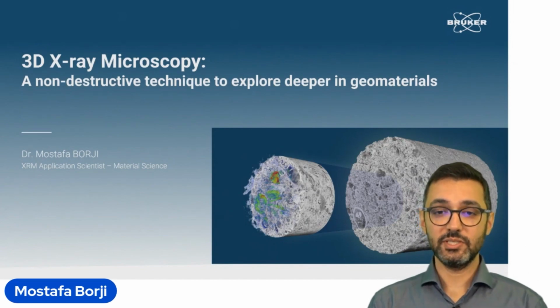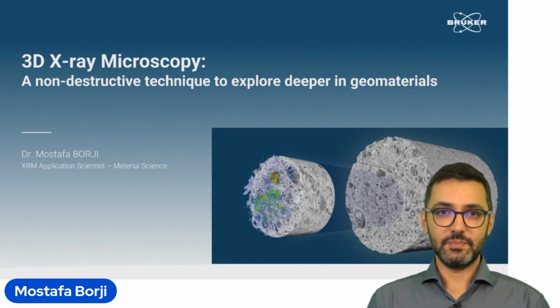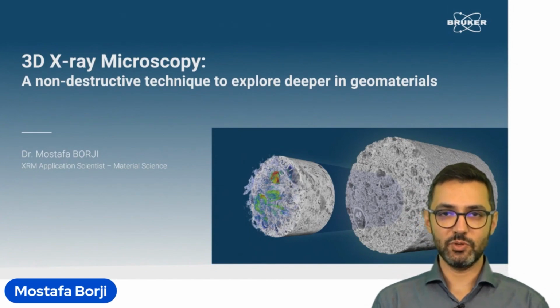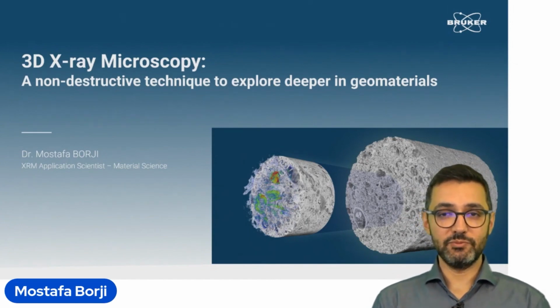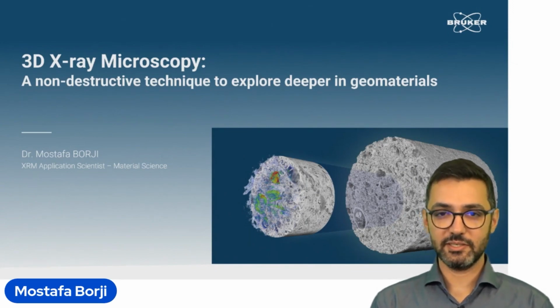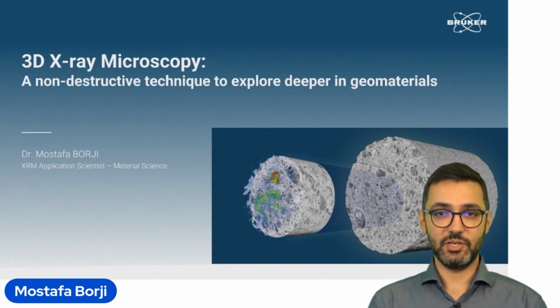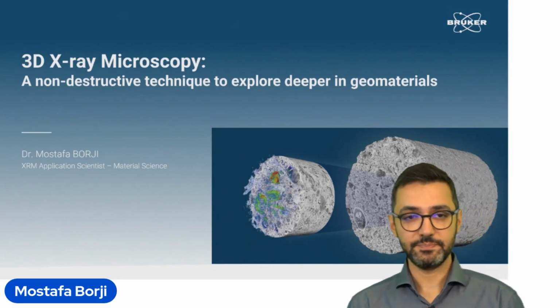During this presentation, I will cover a few concepts regarding X-ray microscopy, how it works, and then I will give you a very short introduction on our devices and our micro-CT scanners. After that, there will be some examples which I prepared regarding the applications in geosciences that we had so far.